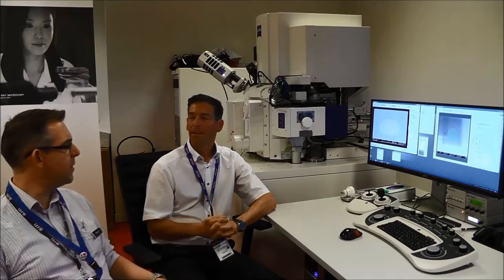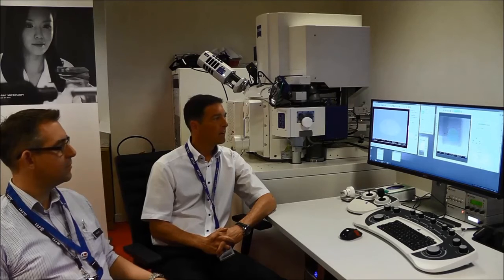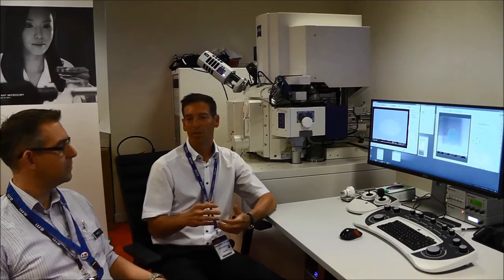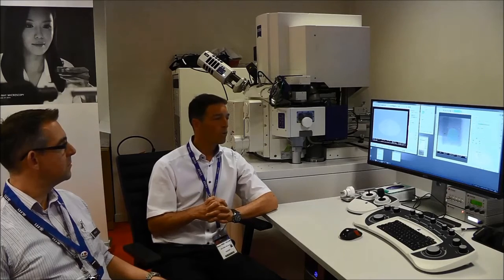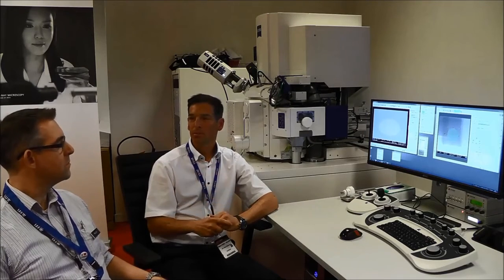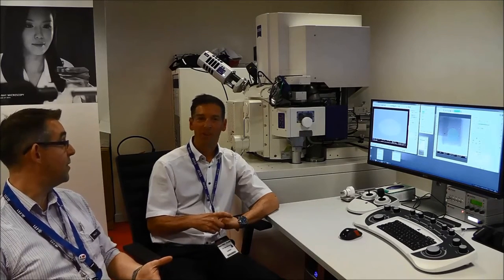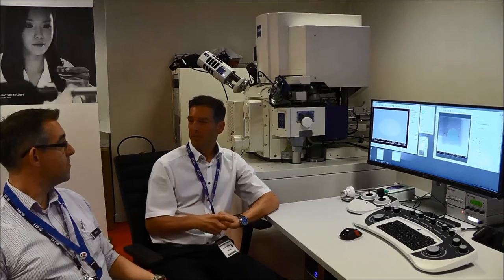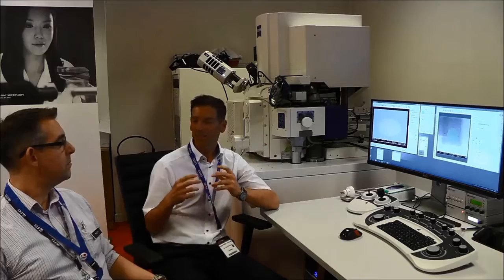Can the system be automated for TEM-level prep? Another aspect is TEM sample prep or cross-section preparation. There are wizards we are showing here that allow the user to very simply generate samples. Samples can be produced at multiple sites on a substrate, and you can load many samples at once and have preparations done on different samples. That would effectively allow you to program it in and set it running in an automated fashion — making use of time when you've gone home, for example. The idea is to optimize machine time, let the instrument work during the night, and save expensive operator time.